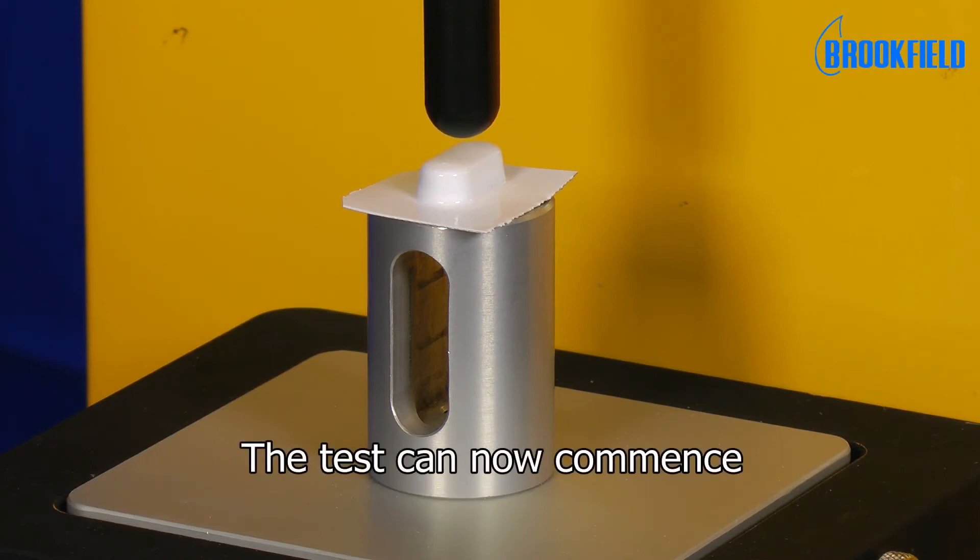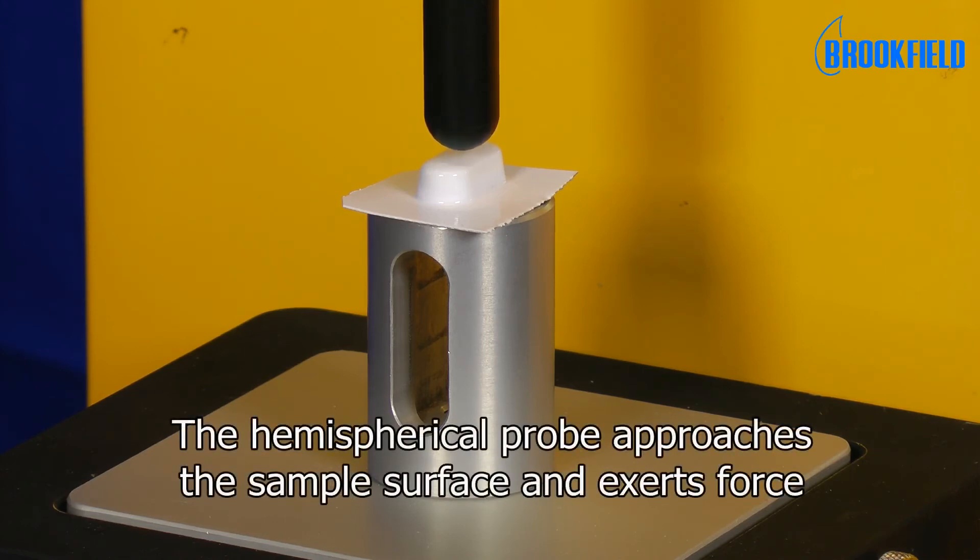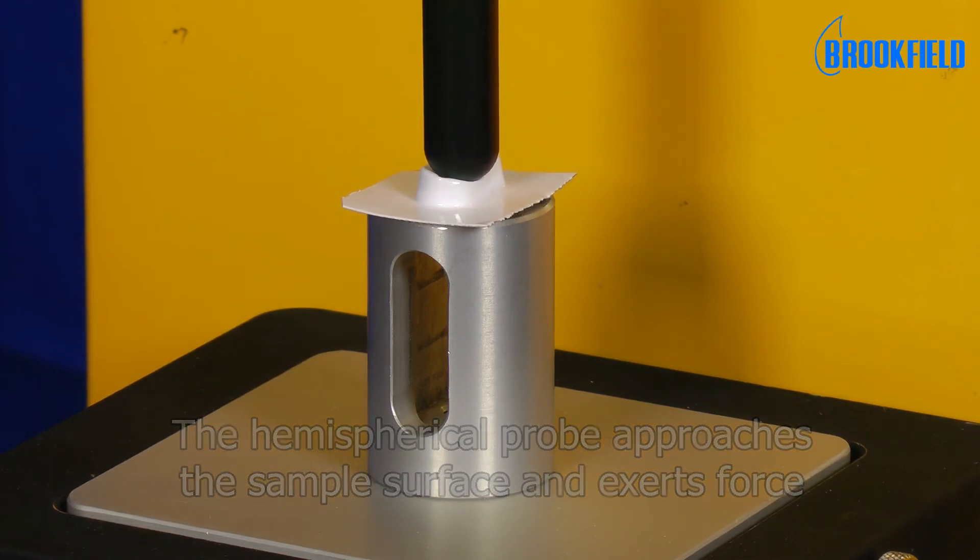We can now start the test. Here you see the hemispherical probe approaching the blister pack. At the sample surface, the probe exerts an increasing force on the blister pack, extracting the tablet in the process.